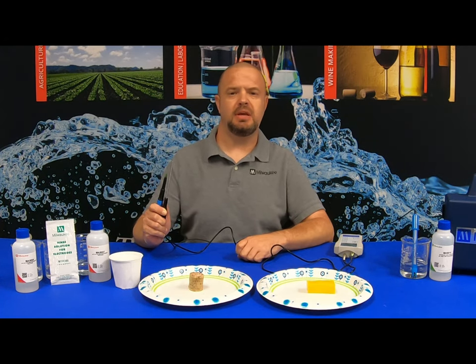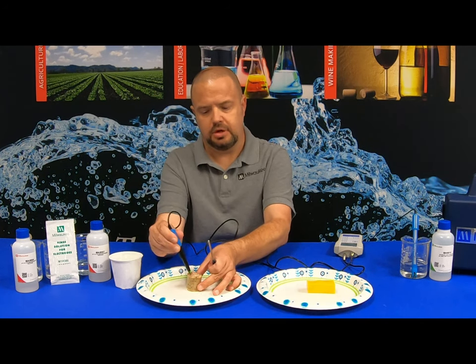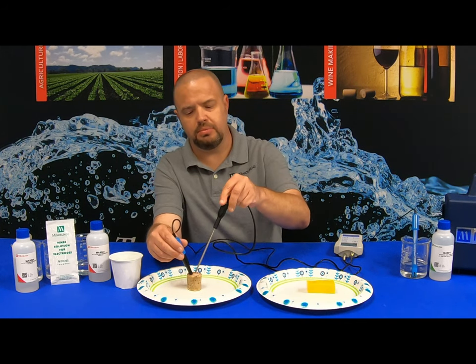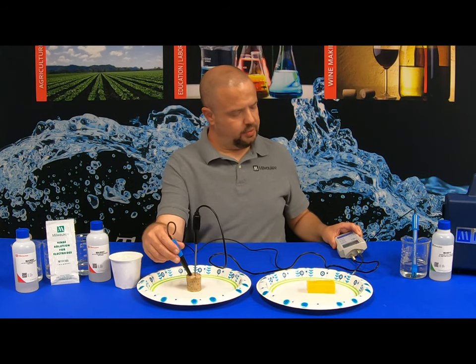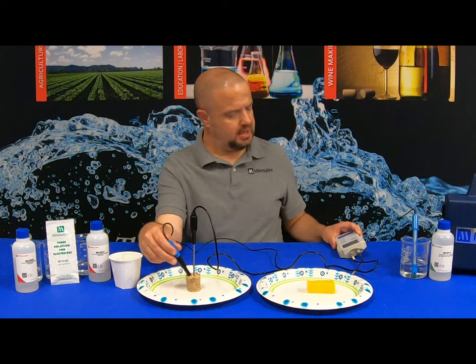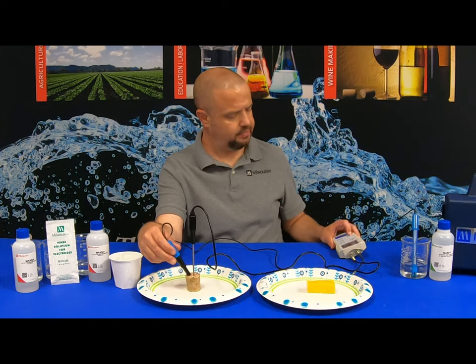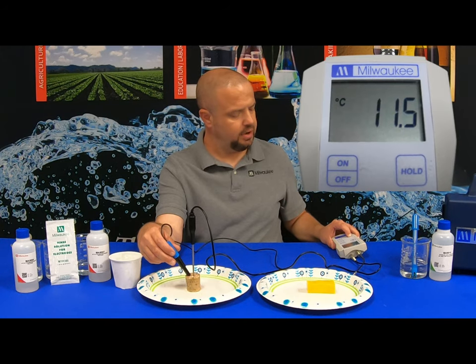Next, let's test the pH of sausage. Take the pH probe with the cone tip down into the meat. You can also take the temperature probe and push it down the same way. We're going to let the reading stabilize — again, there's an hourglass in the upper left-hand, and once that goes away, that is your reading. The sausage pH is coming in at 5.25. Holding the temperature button, it's coming in at 11.5 degrees Celsius.